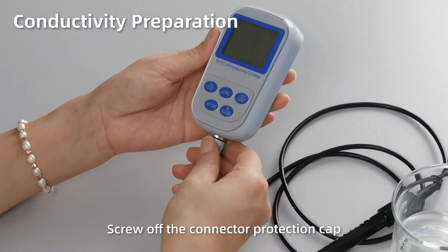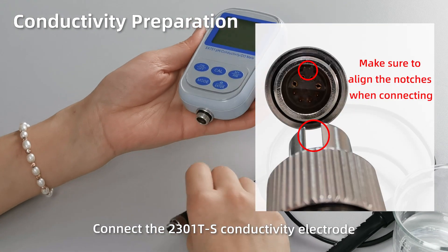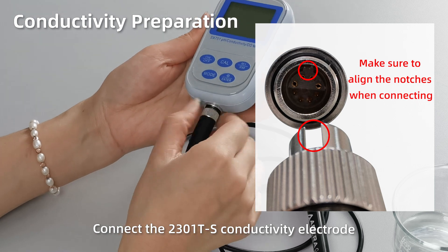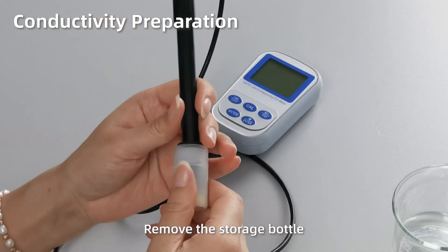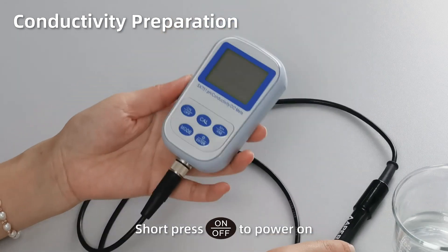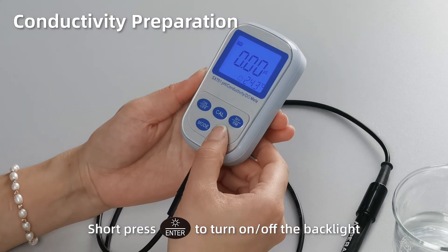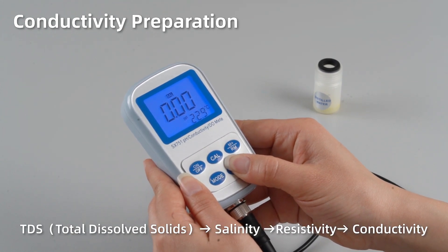Conductivity preparation. Open up the connector protection cap. Connect the 2301 T-S conductivity electrode, making sure to align the notches when connecting. Tighten the metal ring — never twist the black rubber part to avoid damage. Remove the storage bottle. Short press On to power on. Short press Enter to turn on or turn off the backlight. In conductivity mode, hold Enter to browse different measurement modes: from conductivity to TDS, salinity, and resistivity.